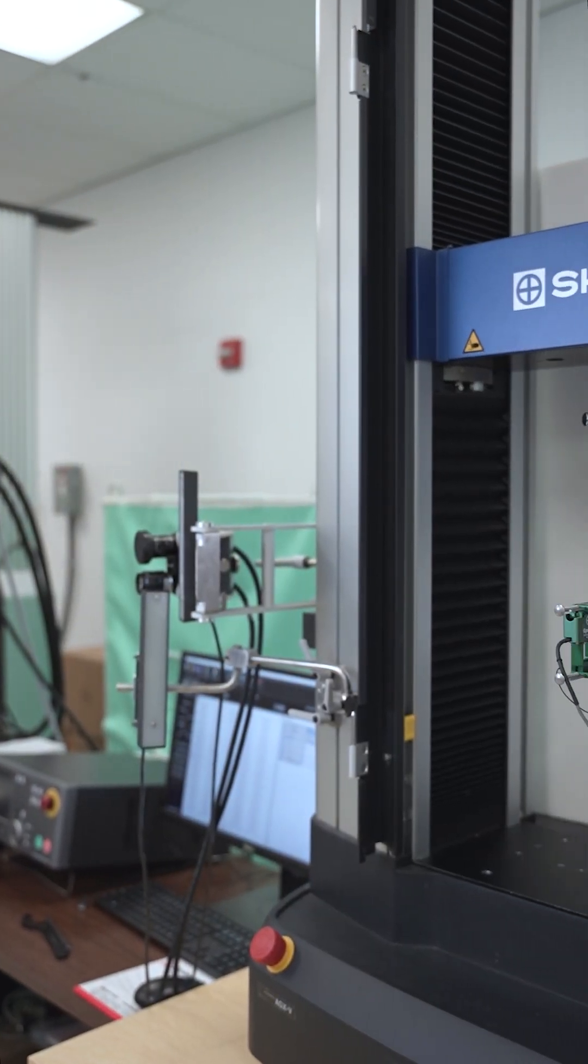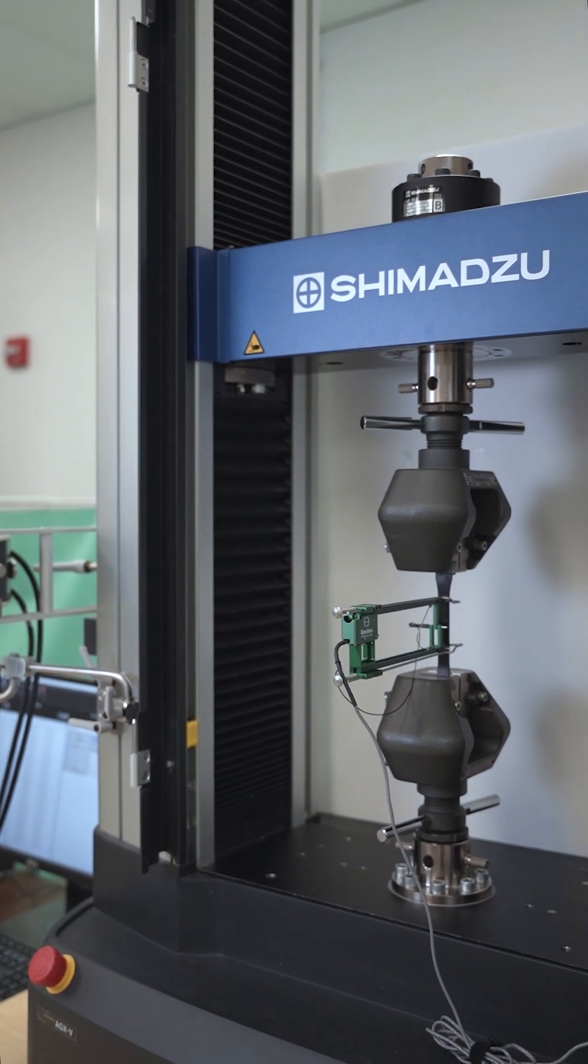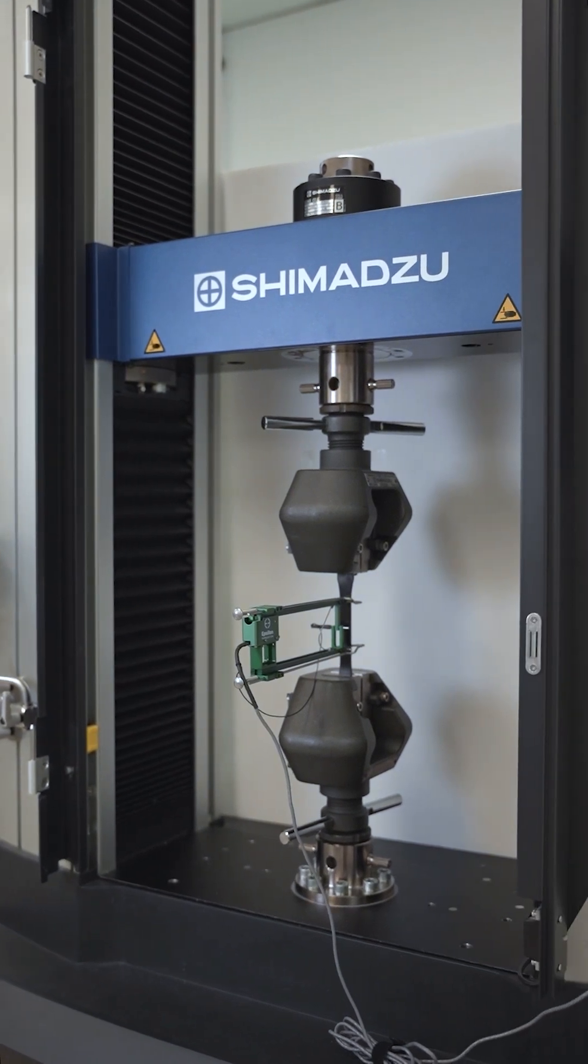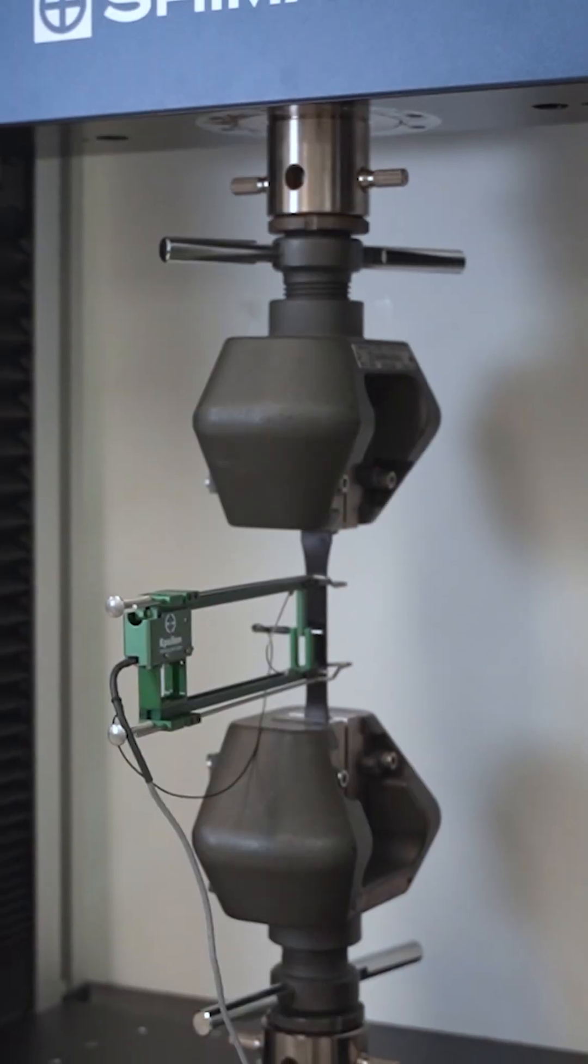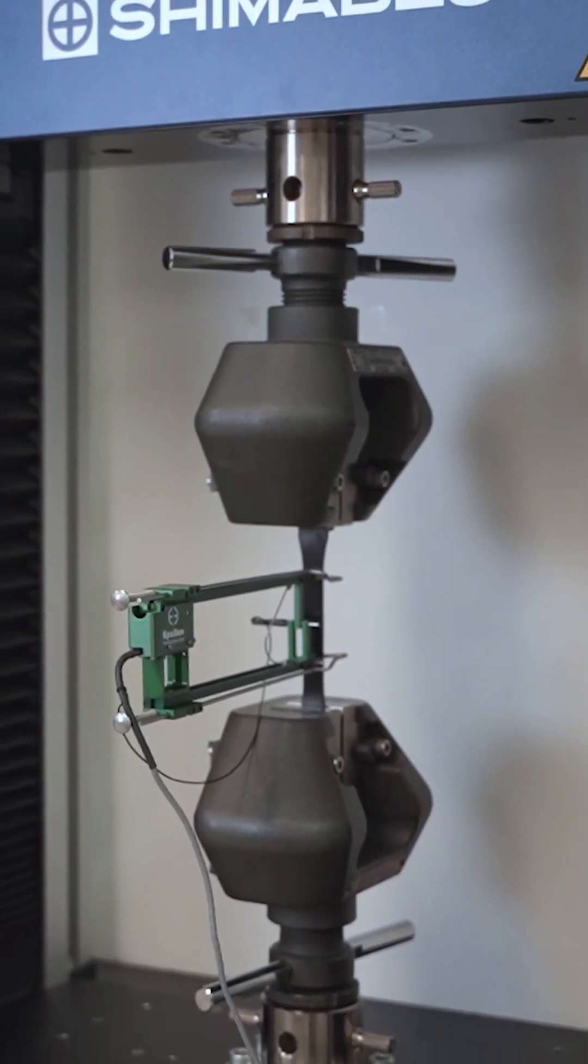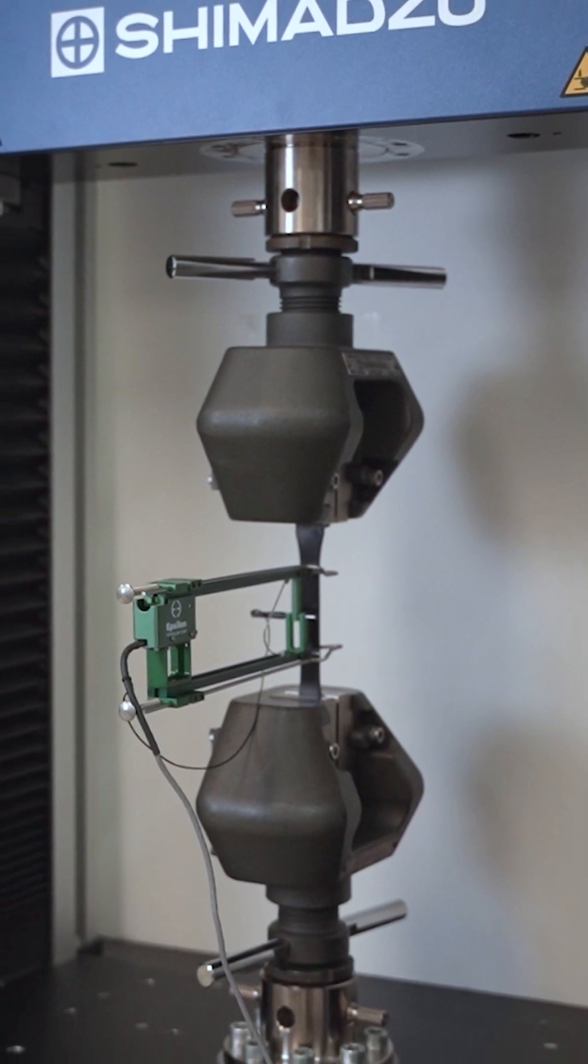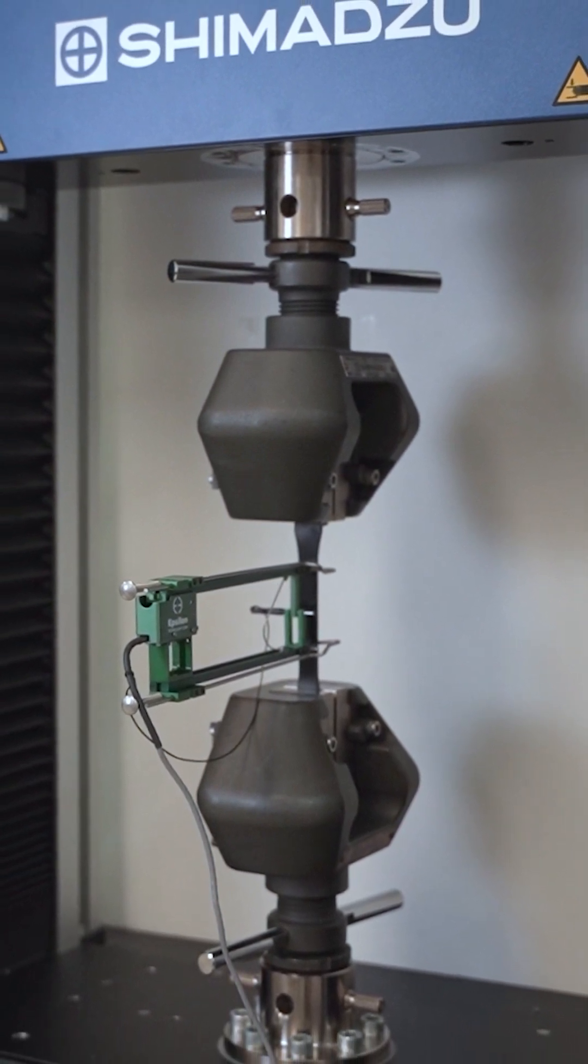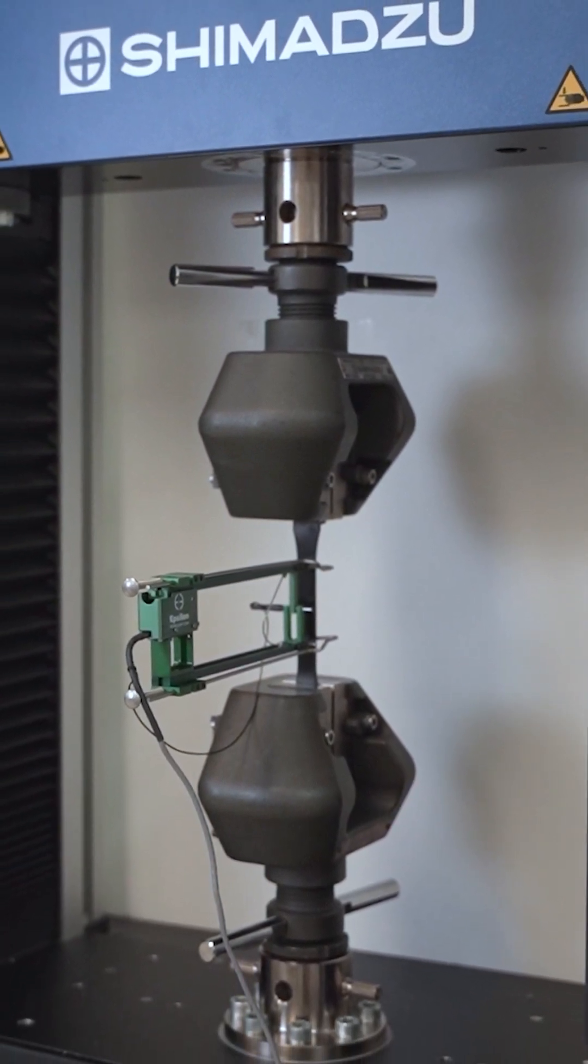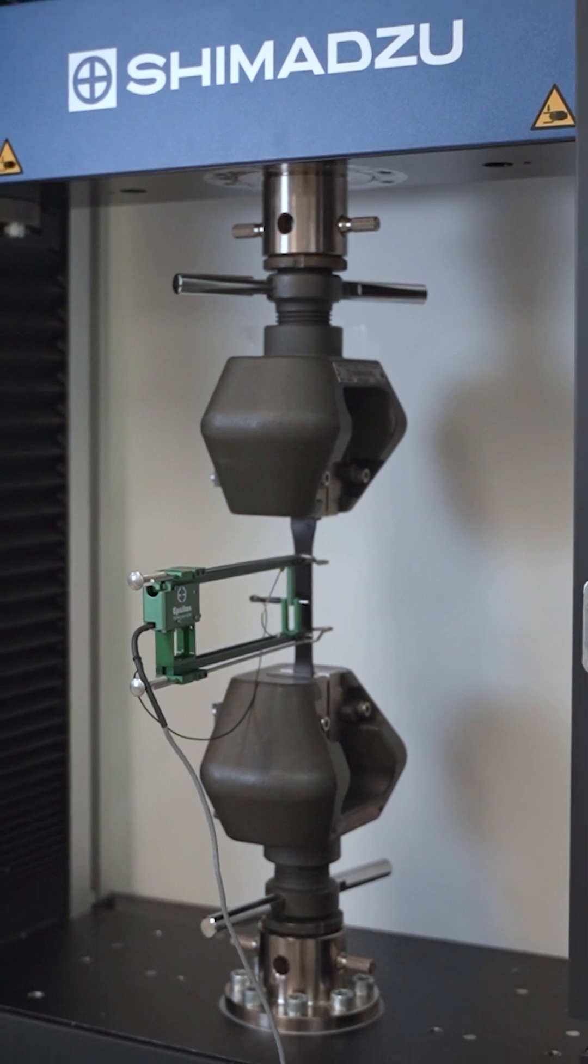The standard can be performed on a tabletop universal testing machine such as Shimadzu's AGSX or AGXV2 with an appropriate load cell, typically 10 kilonewtons, and grips, most commonly pneumatic or non-shift wedge grips.